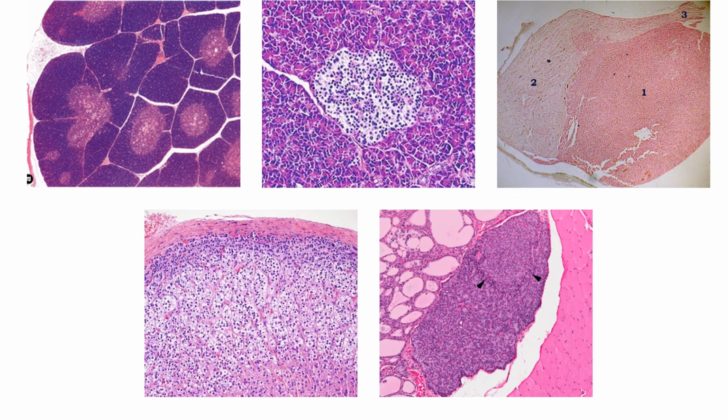In this video, what I'm going to do is show you the specifics of the different endocrine organs that are in our lab book, and then I'm going to give you a quiz on just the appearance. And if you can get past the appearance quiz, you're ready to at least attempt the next part. But if you can't get past the appearance, just learn that first, details second.